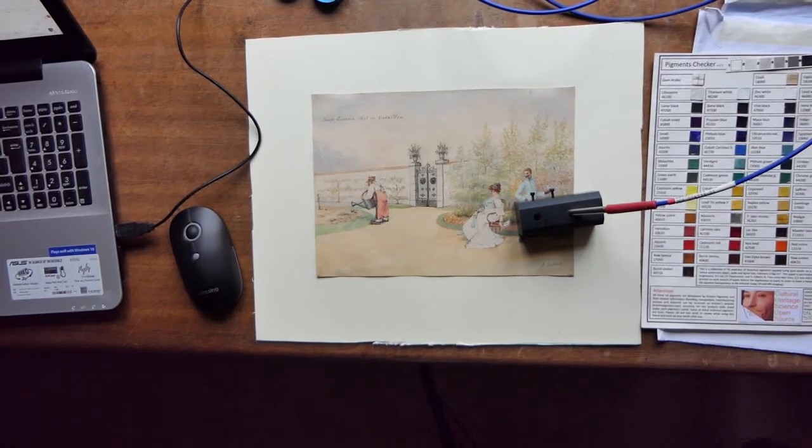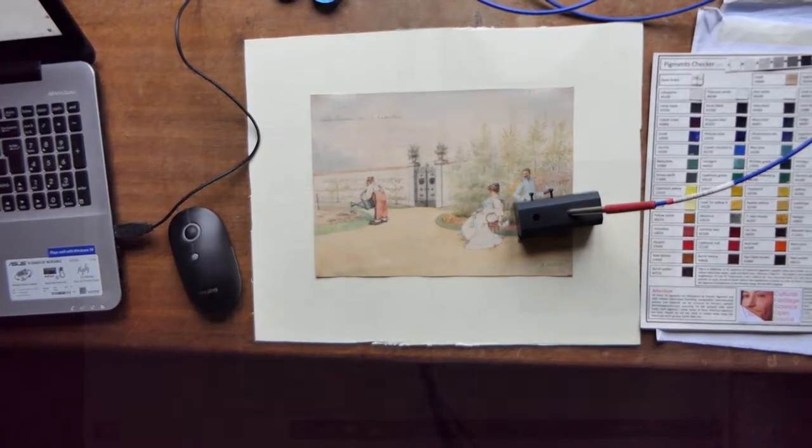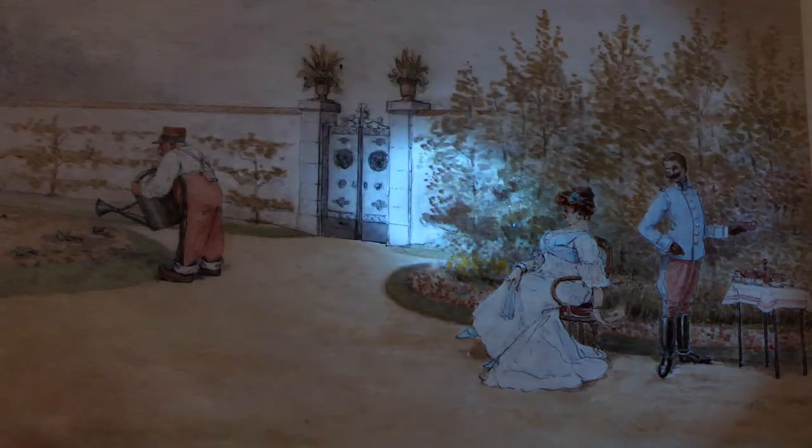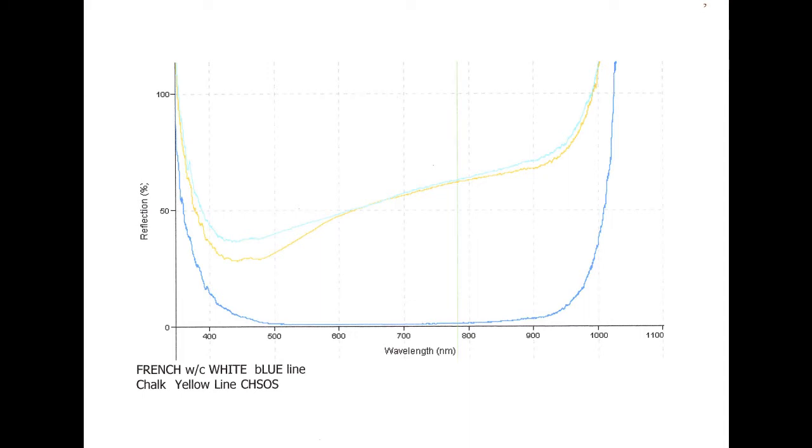Now, XRF showed Pb and As, so we have lead white, but also a high silica reading and phosphorus. However, the UV reflection is pure white, and we normally get a mauvish tinge with lead white. So using FORS could be interesting.